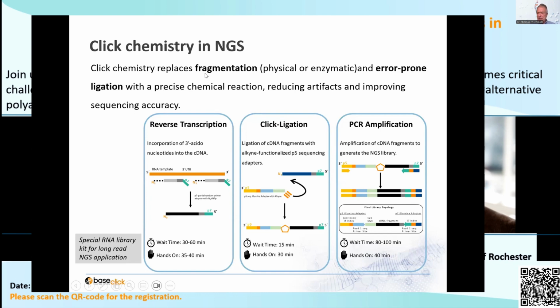Coming now to the application of click chemistry in what we call NGS. As I already mentioned initially, together with the group of Andrew Routh, we developed ClickSeq, which they introduced into a kit system that you can now purchase, as shown by Nassifah.